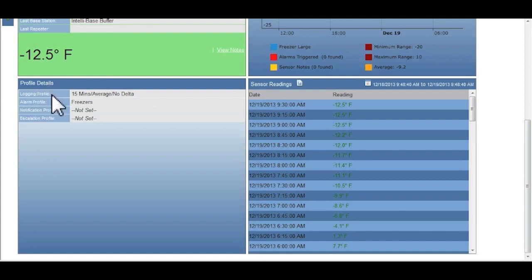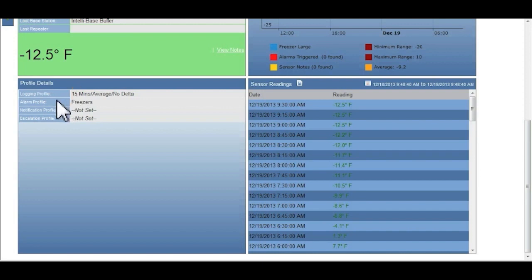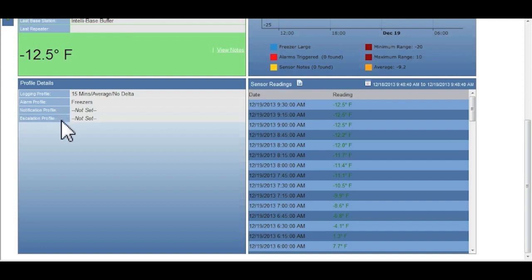The logging profile determines how often temperatures are collected. The alarm profile, in this case it was set for all freezers, notifications, and escalation profiles have not been set. These profile details will be covered specifically and in detail in another video.